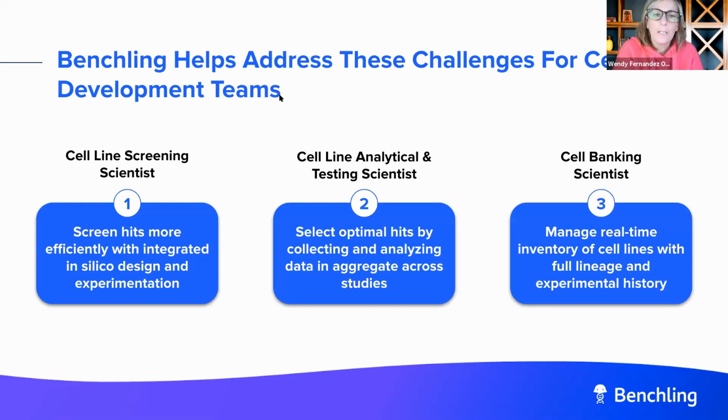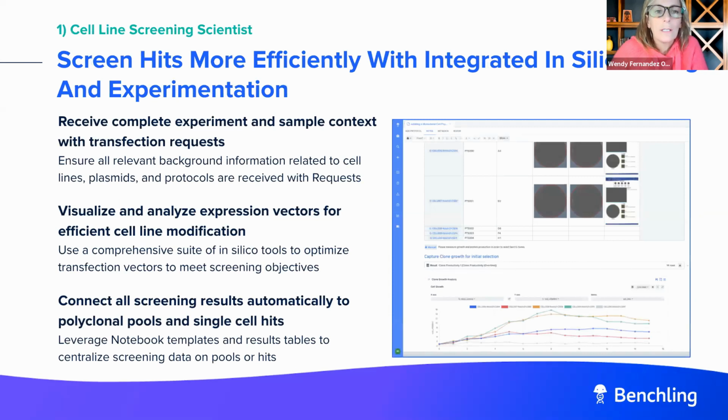I'm going to divide the presentation into three different sections based on these three teams: the cell screening team, the analytical team, and the cell banking team. I'm going to start with the screening team. This is the team that performs the first phases of the line development.